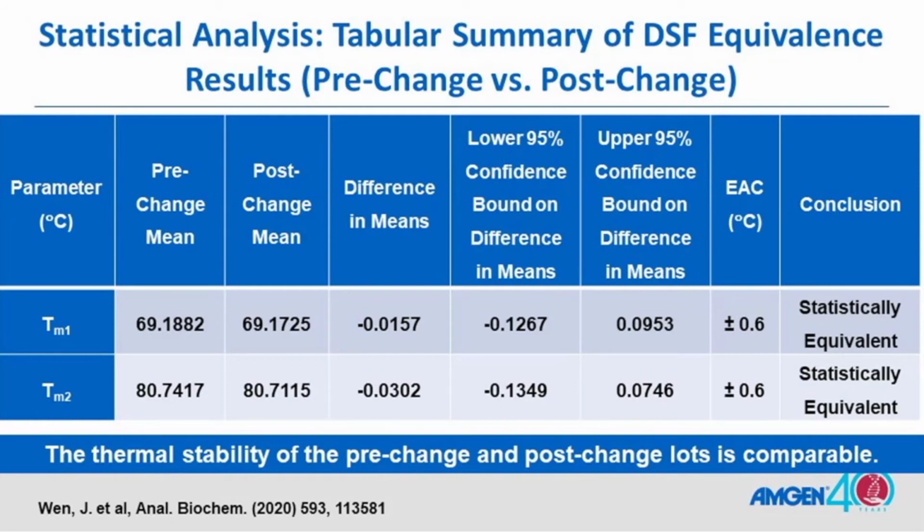So for this comparability study, the overall conclusion is: the thermostability of the pre-change and post-change lots is comparable.